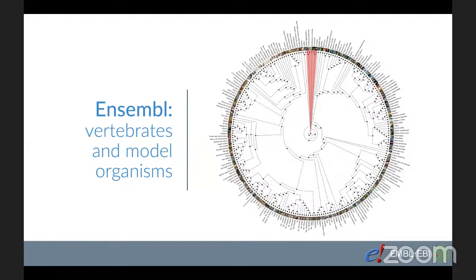They're there for historical reasons, but also for comparative purposes, as they serve as an outgroup to root the tree. We also have important agricultural animal breeds, like, for example, a pig breed and a couple of different mouse strains, here in orange.